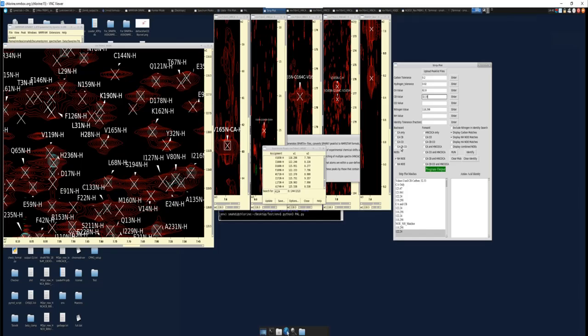The nomenclature here says CACO. What this would be is starting with the HNCA, and then using the HNCACO as a filter. So you would enter a carbonyl value here. So in this case, say we want to go backwards, we would click 177.4.